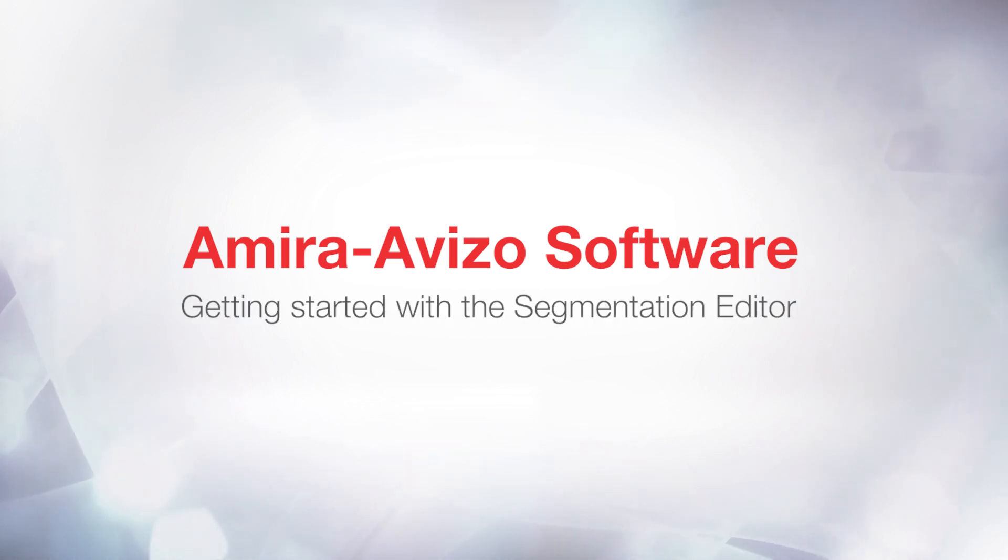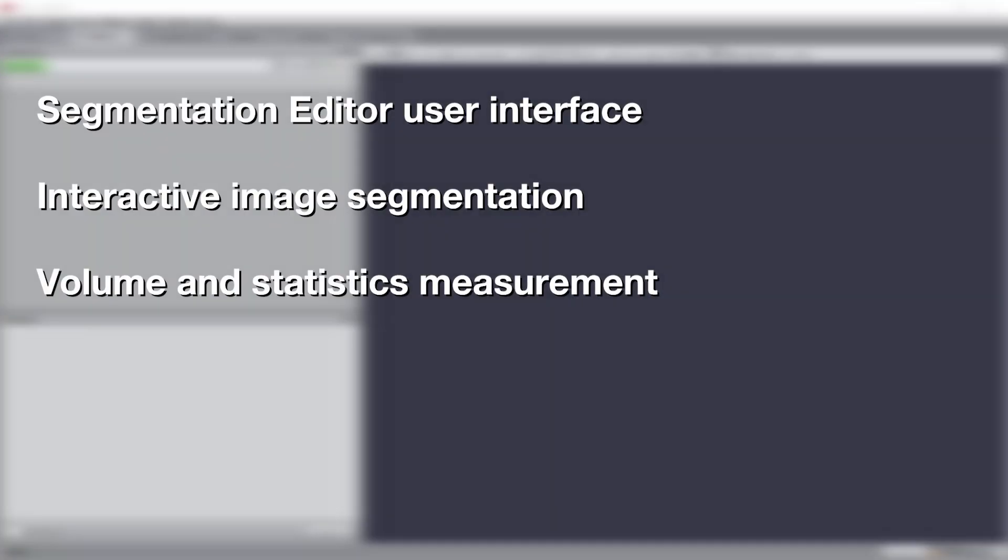Hello, this is Remy from the 3D applications team. By following this tutorial, you will learn how to interactively create a segmentation of a 3D image.